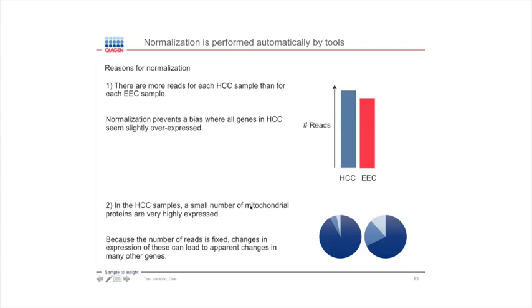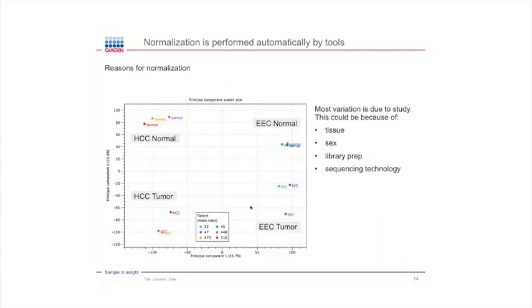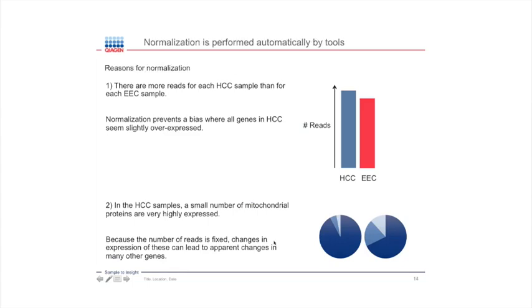And if you know about principal components, you know that the way this plot looks depends very sensitively on the normalization you use. What I've not mentioned, but what is true, is that all of these tools that I just showed you, the heat map, the principal components, the statistics, internally do their own normalization to correct for different biases in the data.